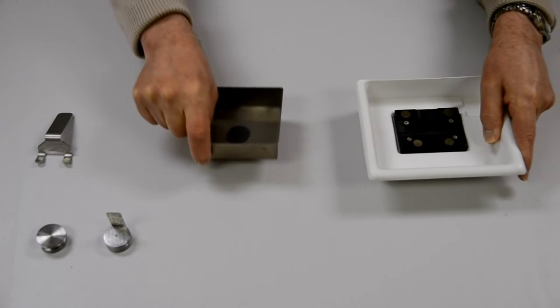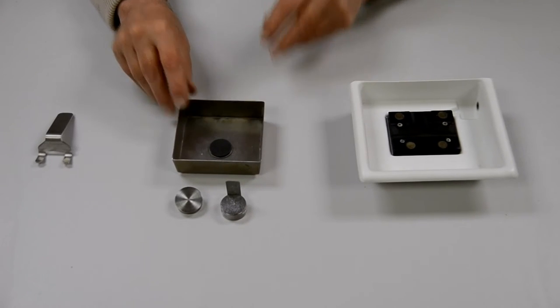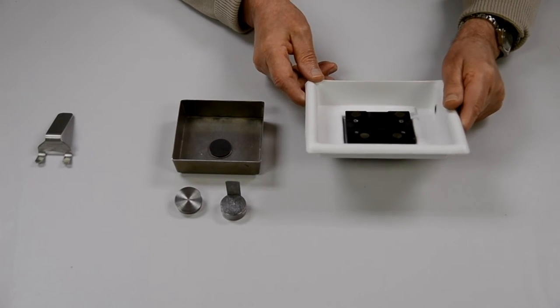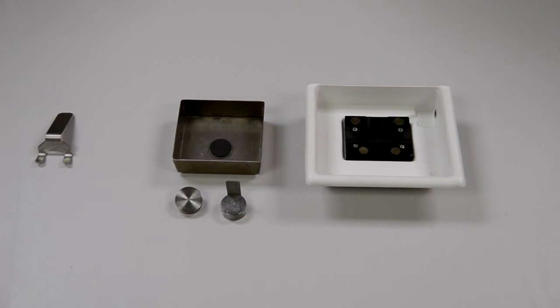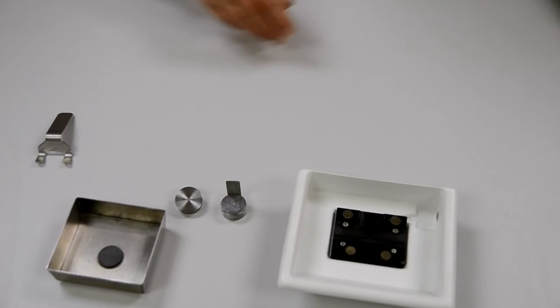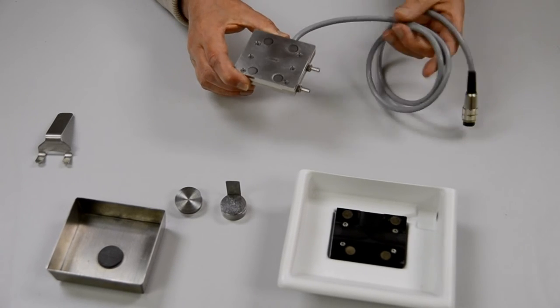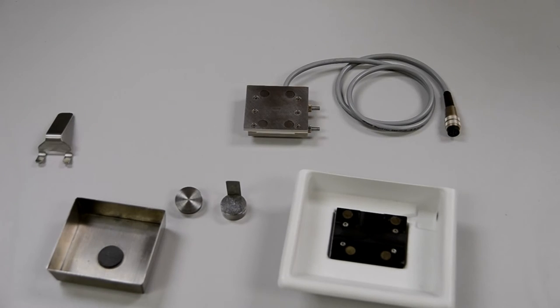The inner bath and the specimen mounts can be autoclaved by normal means up to 120 degrees Celsius. The ice surround outer bath contains thermoplastic materials and cannot be autoclaved. Replacement baths and specimen mounts are available as spares. Optionally, the standard tissue bath may be replaced by a cold tissue bath with temperature control. This will help to keep your slices viable for longer periods. The 7610A temperature controlled tissue bath is dealt with in greater detail later in this video in the optional extras chapter.